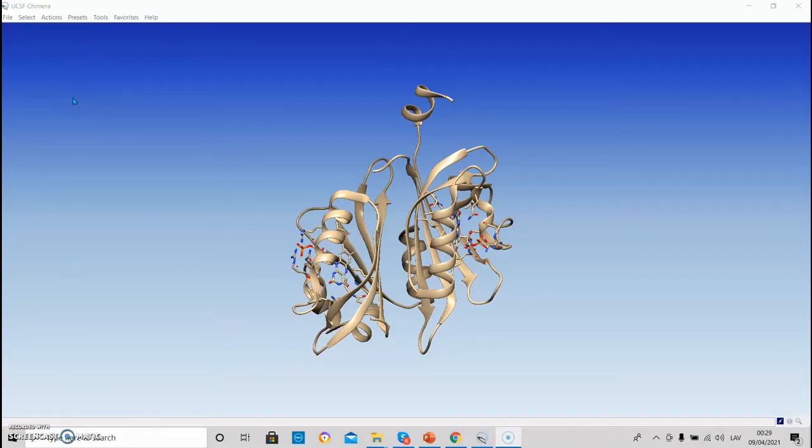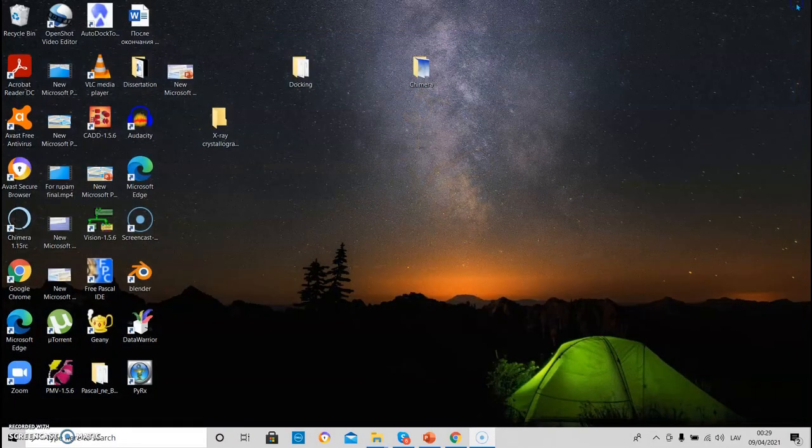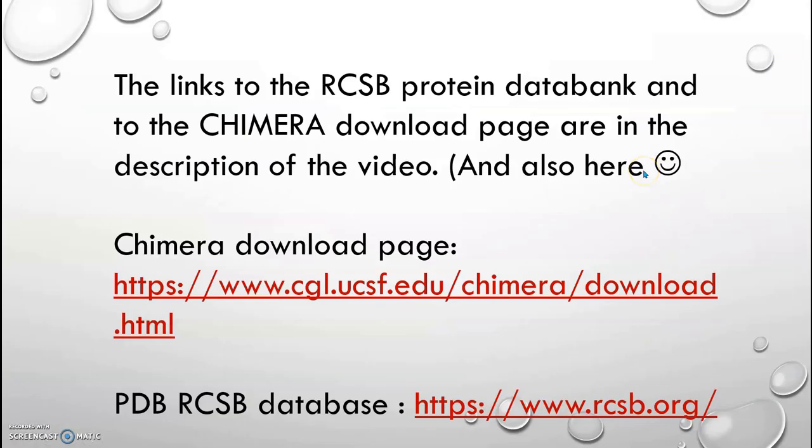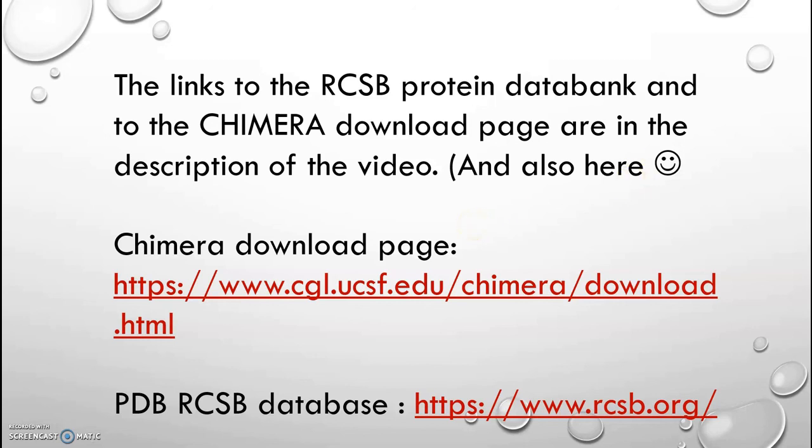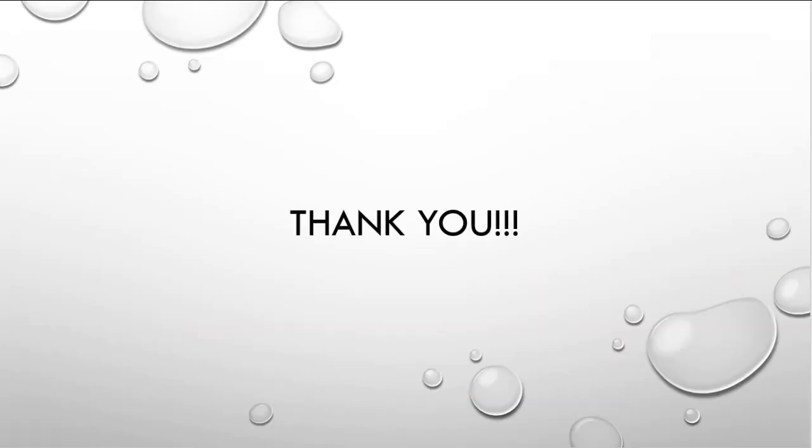And for today, that's it. We can close Chimera. The links of the Chimera download page and the RCSB protein databank will be provided in the descriptions, and they are also on this slide. Thanks for attention.